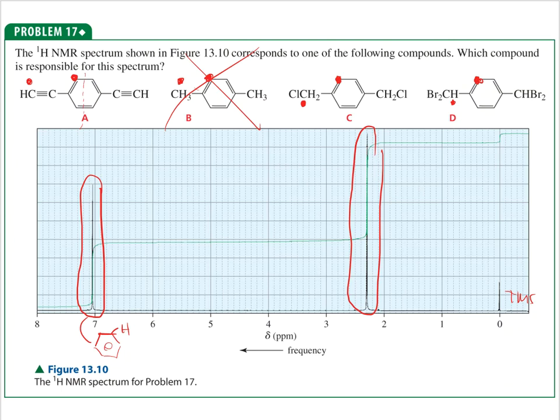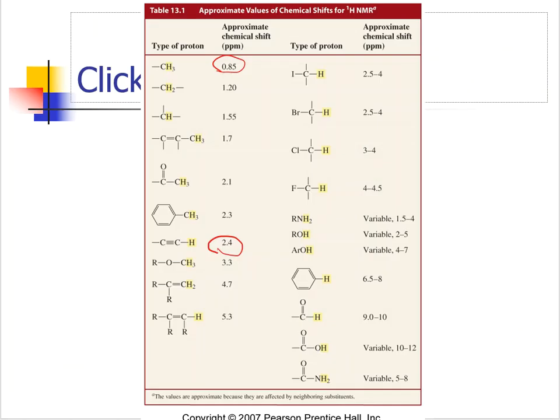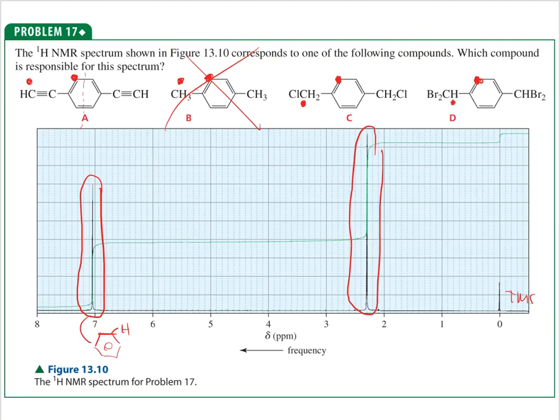And then I continue on to C, and that looks like a chloro group. And I find the chloro group here. And that chloro group says it should have a signal between 3 to 4. All right. So that proton on a carbon with a chloro group, that's what we have here. That's going to be higher than what's stated here on the screen.